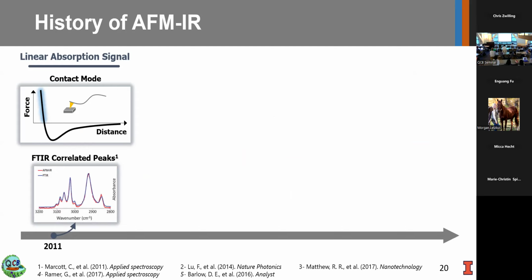So early studies of AFM-IR typically report measurements of very thick samples due to lack of sensitivity early on, which typically result in spectra that are really highly correlated to FTIR far field measurements shown in this spectra here. But when you go thicker, the resolution tends to get a little worse because these fields extend deeper into the sample and your resolution gets blurred.